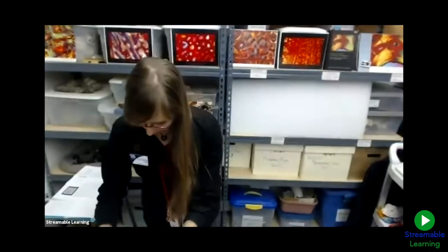All right, excellent. So before we begin cutting things up, it's important to take a number of initial steps. The first one is to get permission for your project and make sure that you have correct permission to permanently alter the fossil. The next is to gather data from the fossil while it's in one piece. So, to recap: get permission, gather data from the specimen, and then you are ready to make thin sections of your specimens. I think I will show you in hand.